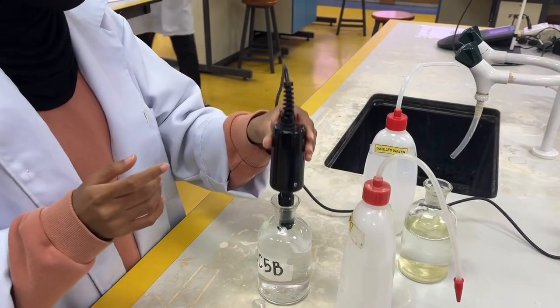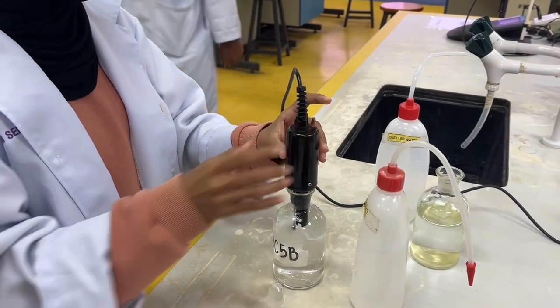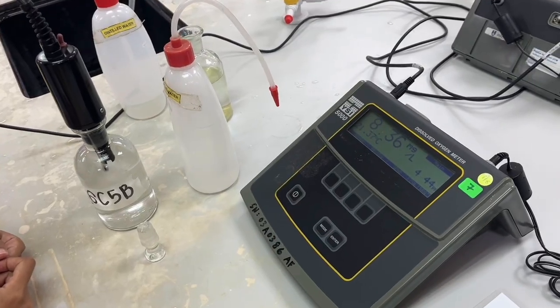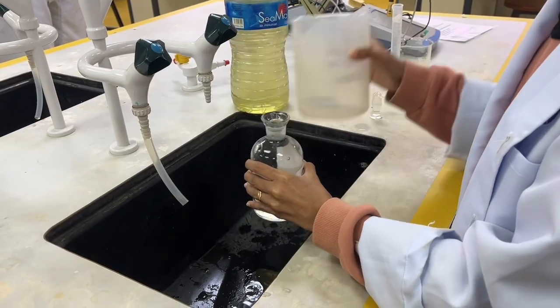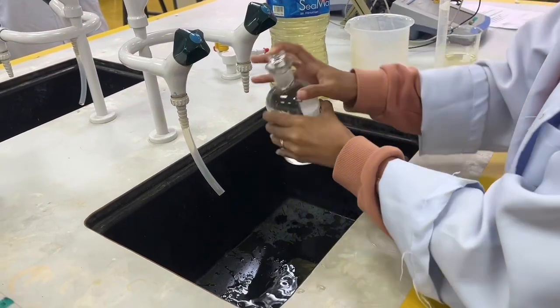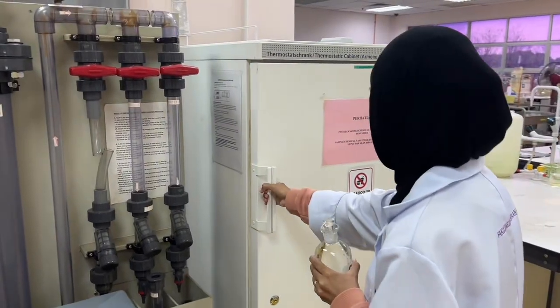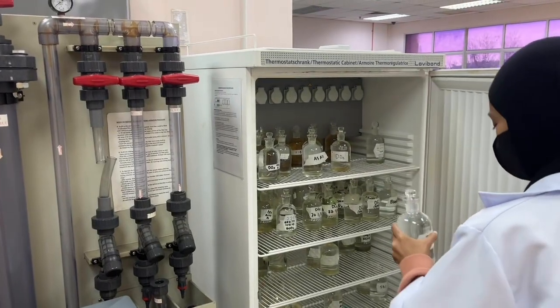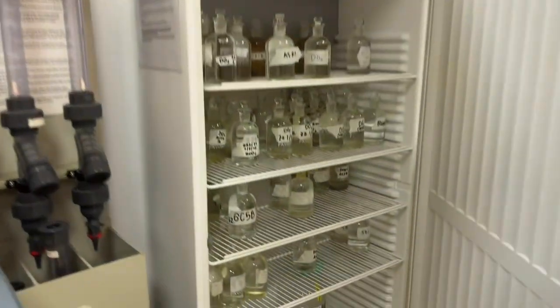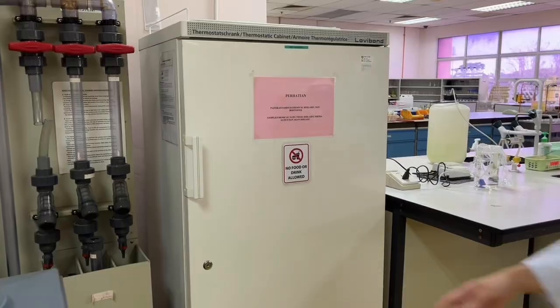and turn the bottle upside down to make sure that there are no bubbles. Then use the DO meter to measure the dissolved oxygen as DO0. Make sure that the end of the DO meter is cleaned with distilled water before every use. Take 3 readings to get the average of DO0. Then fill up the BOD bottle again with dilution water to avoid air pockets inside the bottle. Put the BOD bottle inside the incubator at 20 degrees Celsius for 5 days.